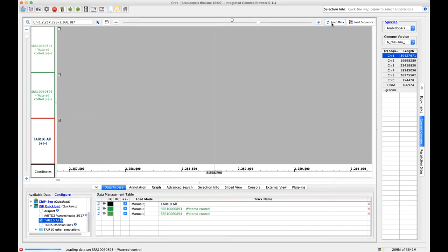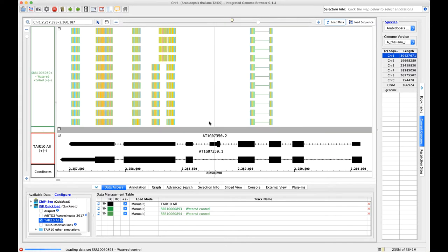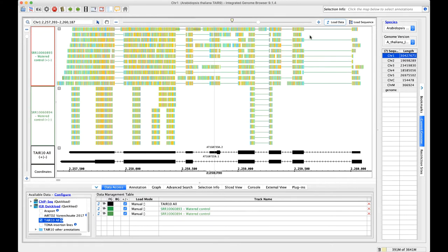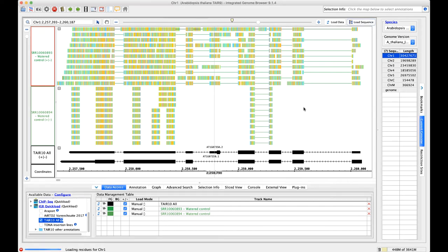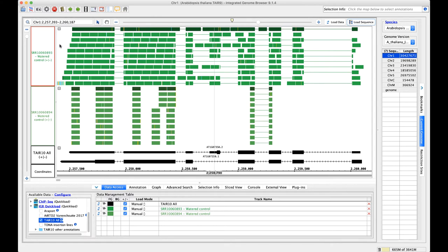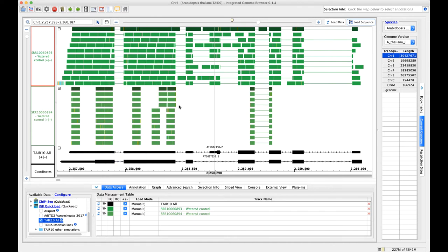I'm going to go ahead and load the data for that gene. There are our TAIR10 models. We're loading in our reads from our two samples that we're interested in. I'm going to put the 893 on top of 894. I'm also going to load the sequence for this gene. You can see our foreground track color. Both these samples are green. They're both watered controls. 893 was the larger of the two samples. That was the one that was about 1.6 gigs. This looks pretty good, kind of about what we would expect in terms of reads for an RNA-seq study.